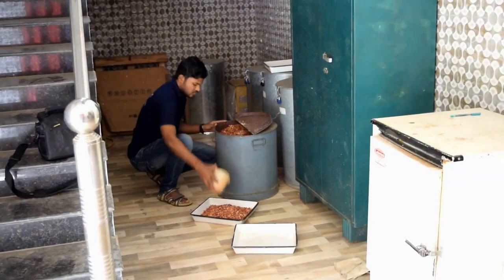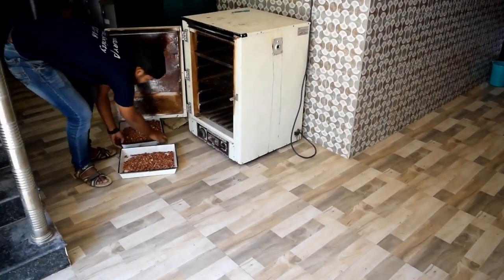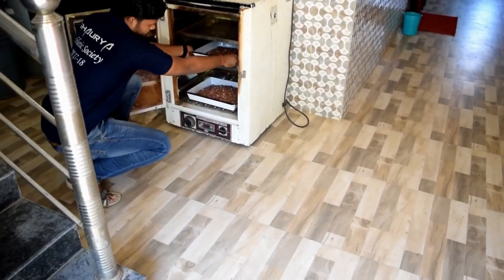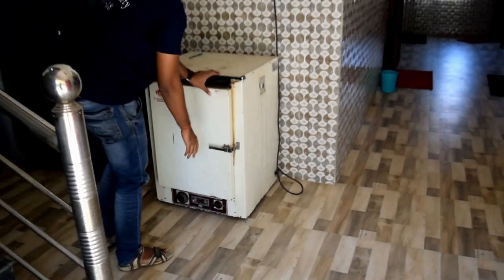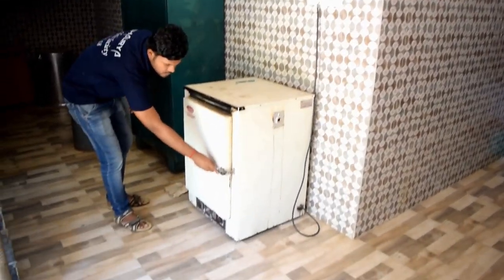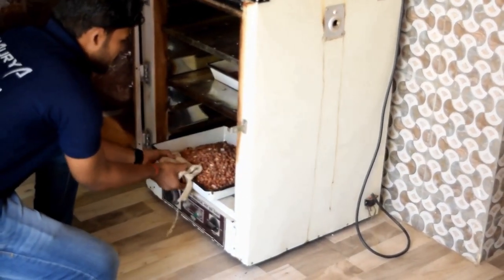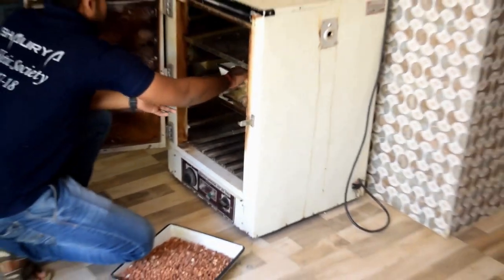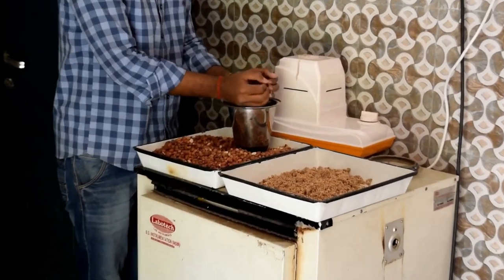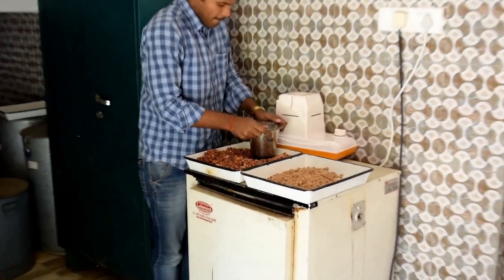Groundnut kernels are taken in metal trays and the trays are placed in hot air oven at 100 degrees Celsius for 30 minutes. The roasted kernels are ground in grinder.